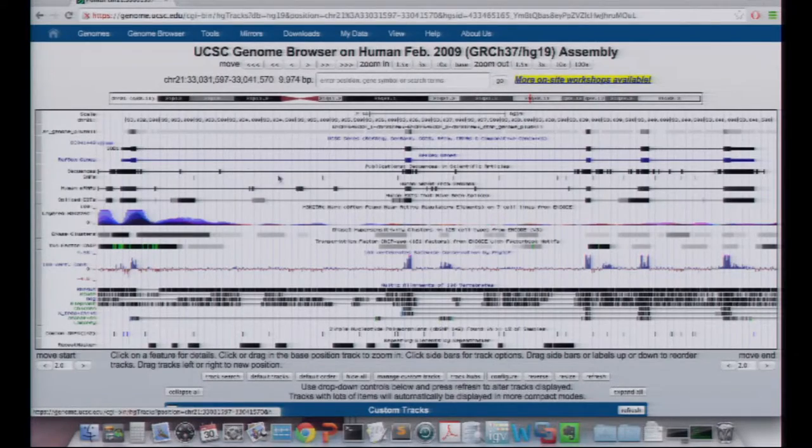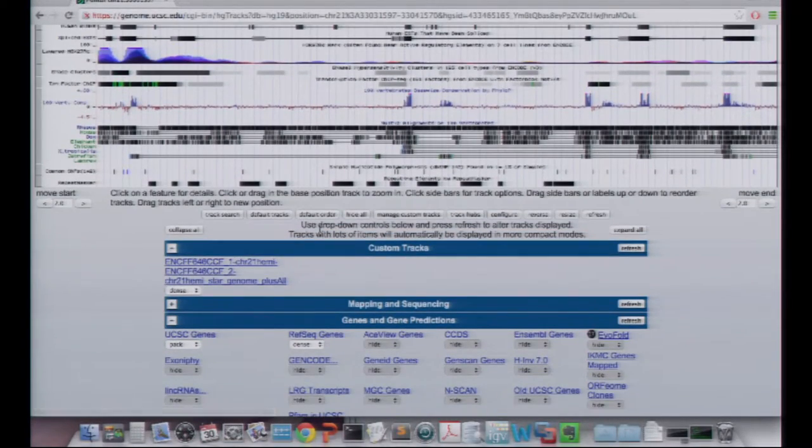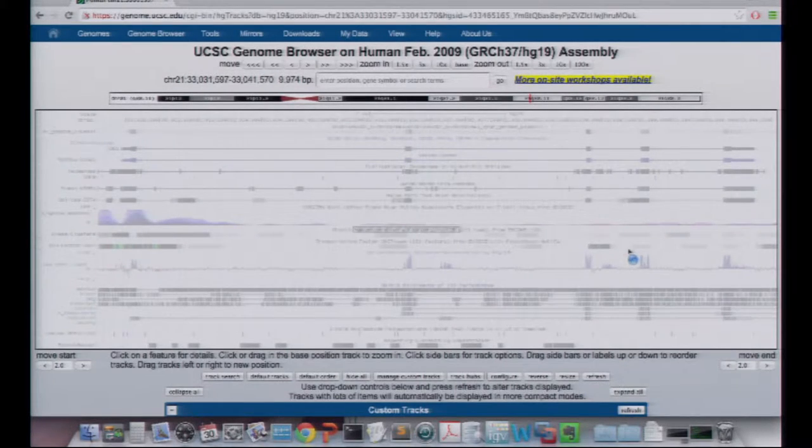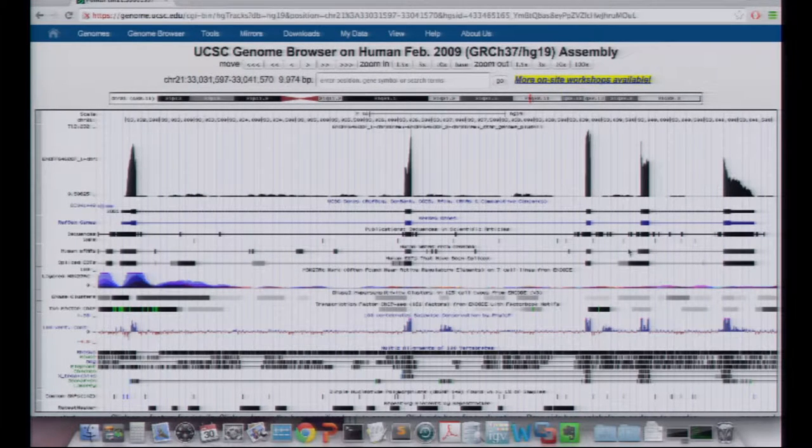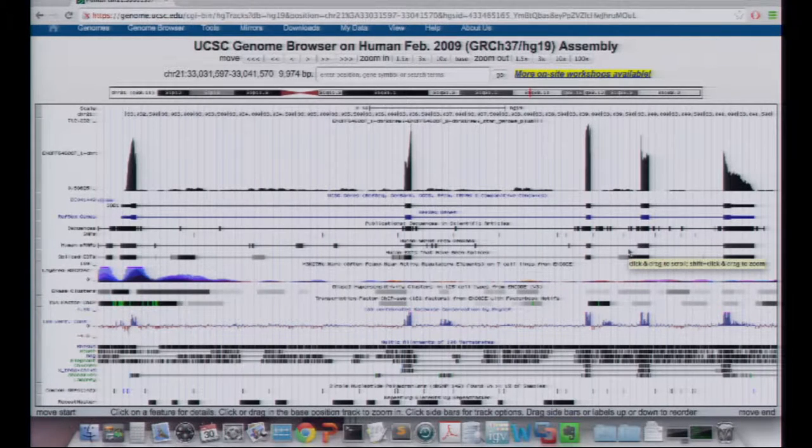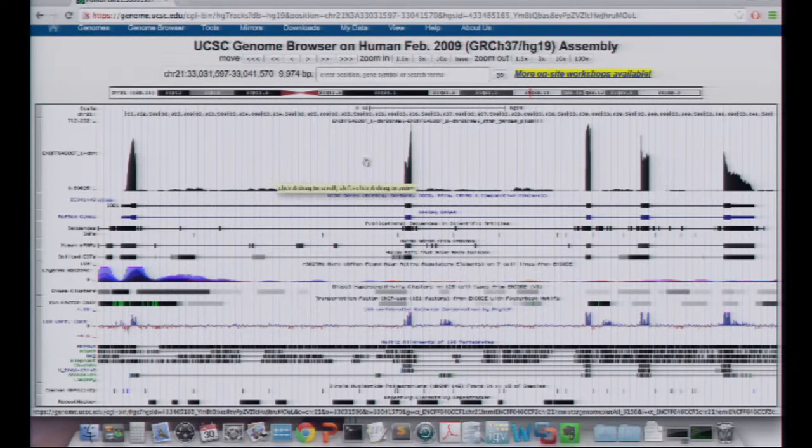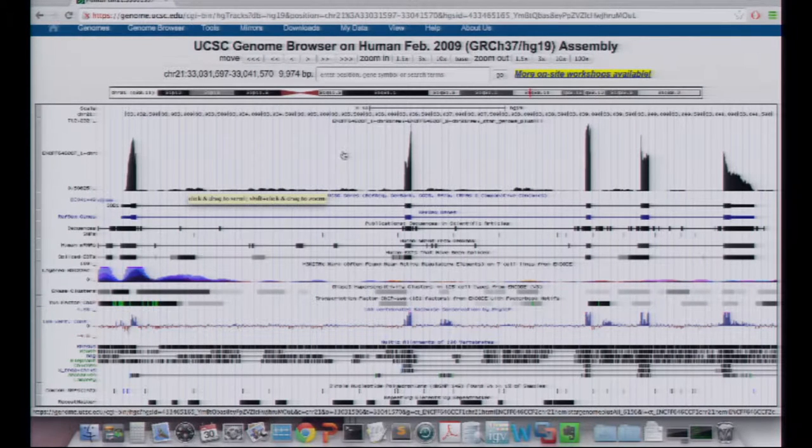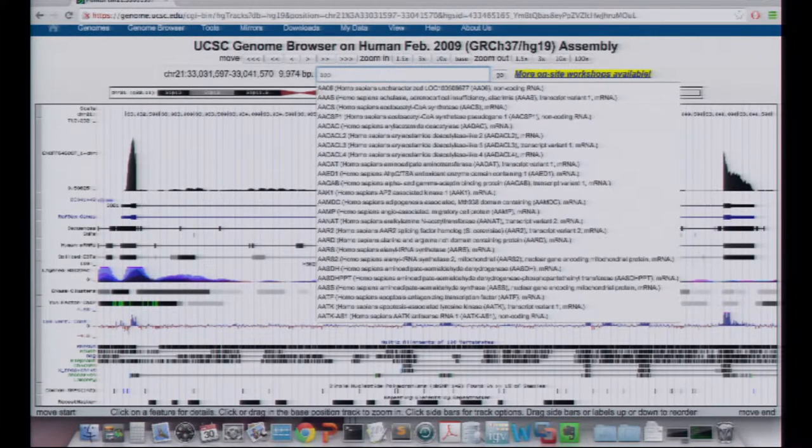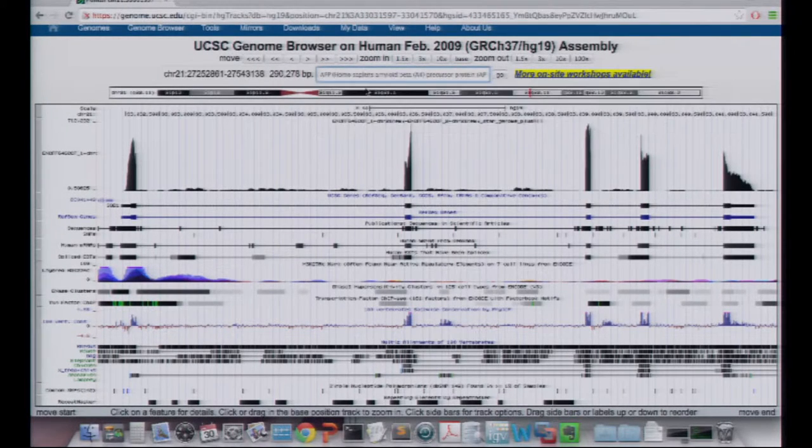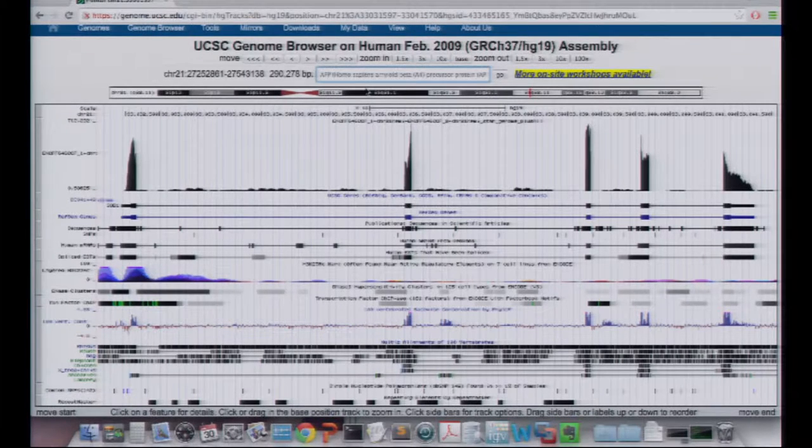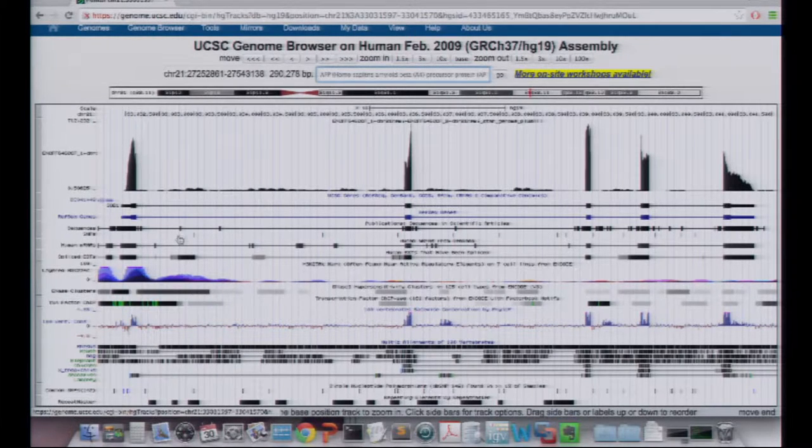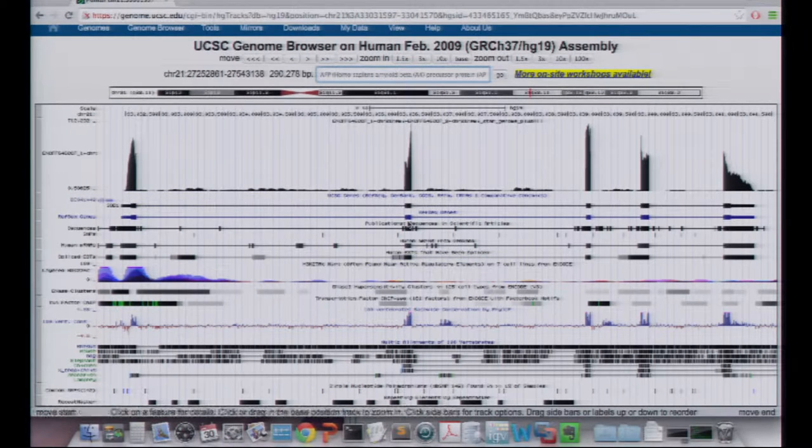And it's actually there in the top in a format that's hard to read, but it's a little easier to see. If you go to custom tracks here, I'm not the browser expert, the polling is here, but I can click full. Refresh that, that refresh button. You can see the RNA-seq of superoxide dismutase. Okay. Maybe it wasn't that impressive. Coincidentally, SOD happens to be on chromosome 21, and that's the UC Santa Cruz's default position, but also you can go to another gene like amyloid precursor, which was my other example. Click amyloid precursor. While this is doing its thing, it's always nice to see when your RNA-seq lines up on your exons of your gene.